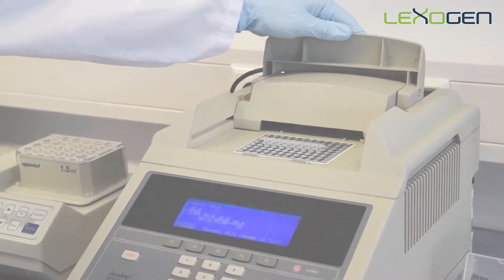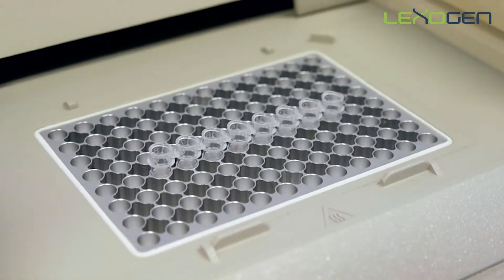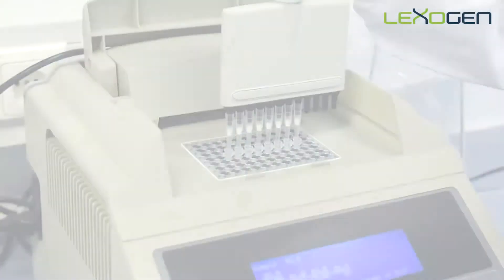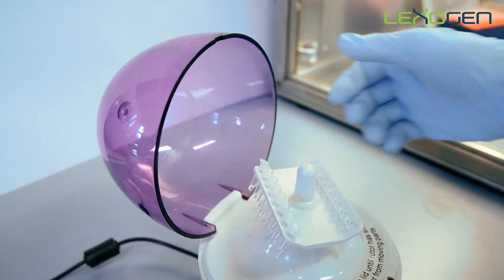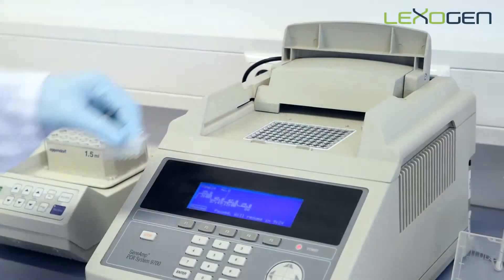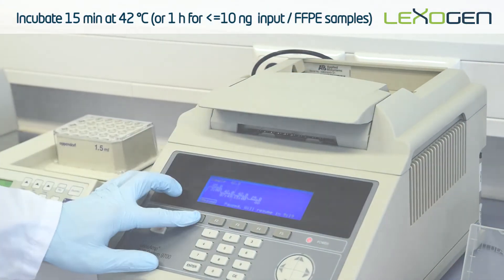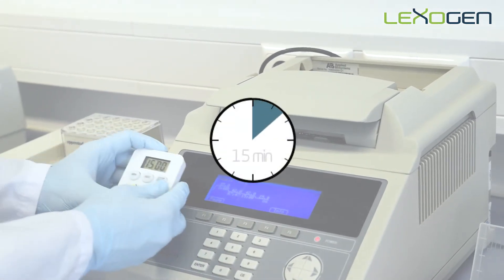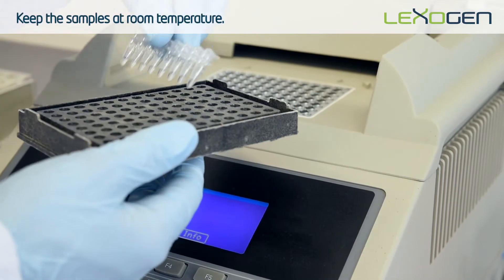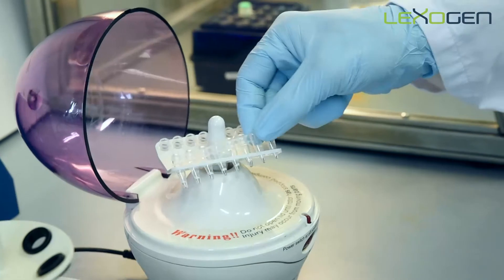After denaturation is complete, add the pre-warmed master mix to the samples while they remain on the thermocycler. Mix the samples by pipetting. Briefly spin down the samples. Place the samples back on the thermocycler and incubate for 15 minutes at 42 degrees. After incubation, keep the samples at room temperature. Briefly spin down the samples and proceed directly to RNA removal.